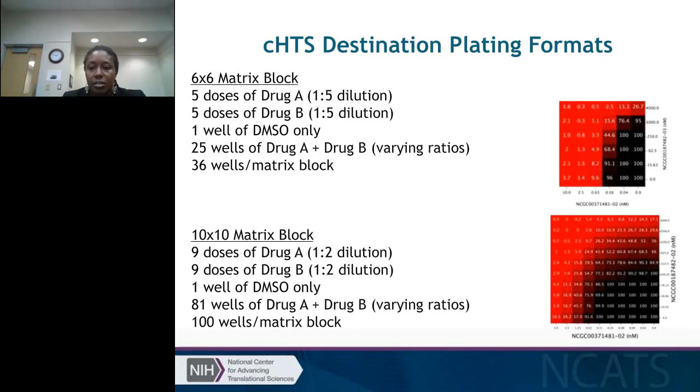And so you can see in both of these blocks the area where some possible drug synergy is happening. For example, if you look at this well right here that I've highlighted in red at 44.6% viability, you can see that in the single agent wells, both drug A and drug B are really doing almost nothing. All the cells are alive, 96% of the cells are alive. Whereas if you combine these two doses, you get about 44% of the cells left alive, which is the beginning of drug synergy.